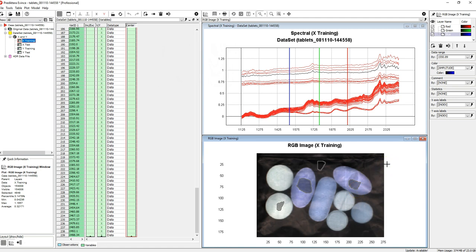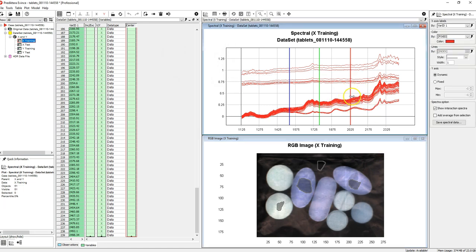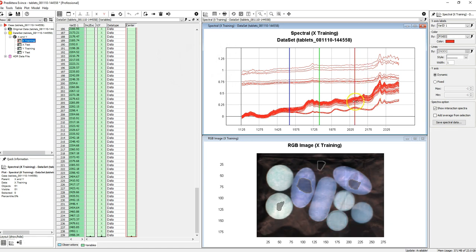The three vertical lines in the spectral plot are showing you the three spectral bands that are used to generate the pseudo RGB image color. By dragging these lines you can change the bands that are used.